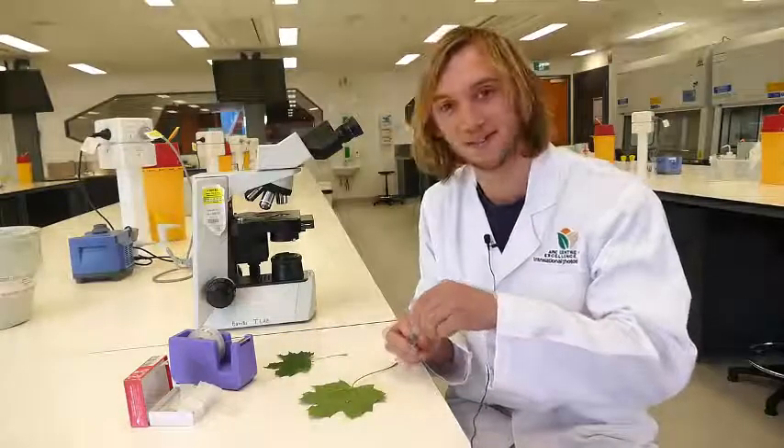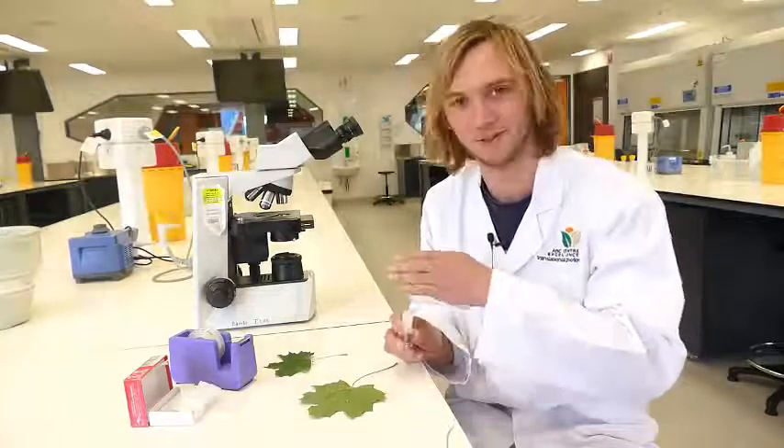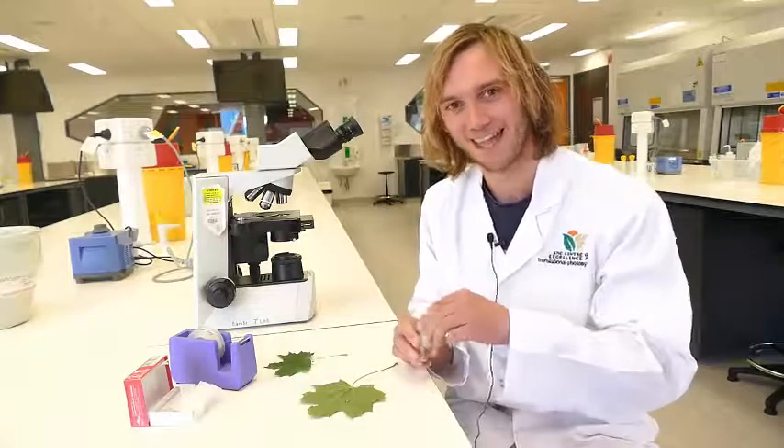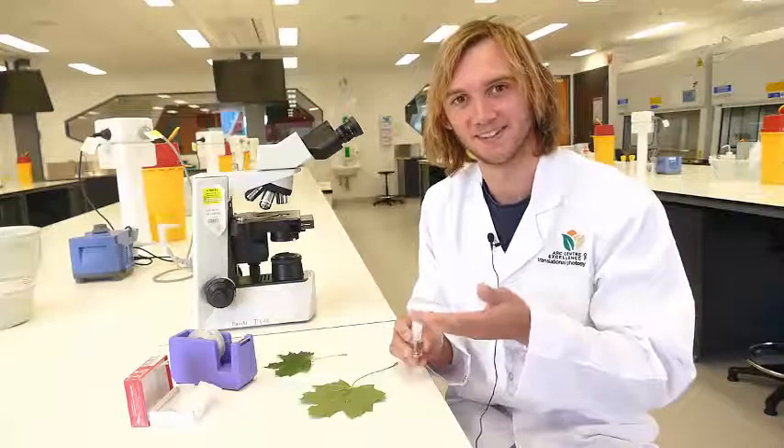We recommend you use clear nail polish so that you can see through it when you view it under the microscope. We also recommend that you first try the underside of the leaf.